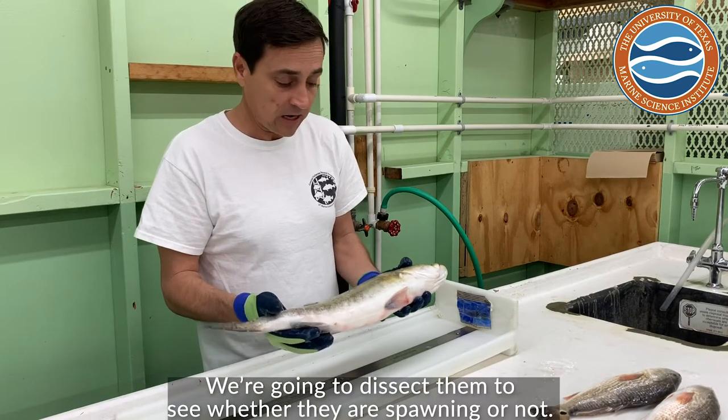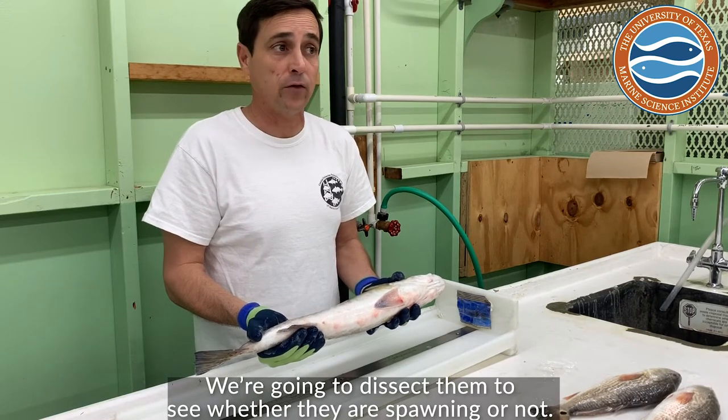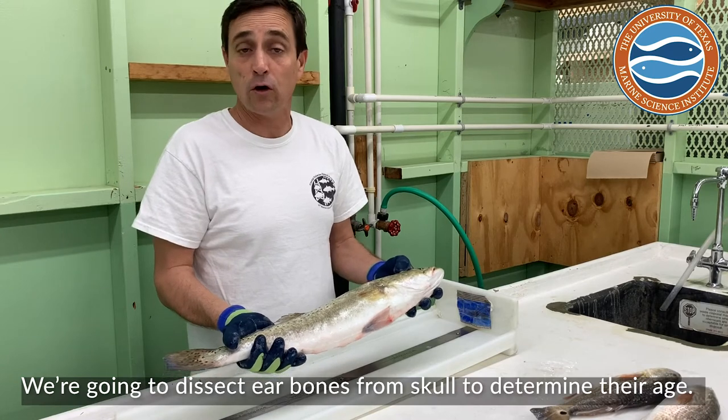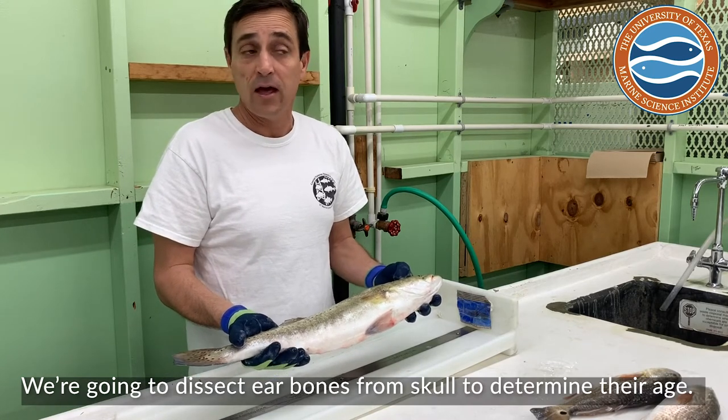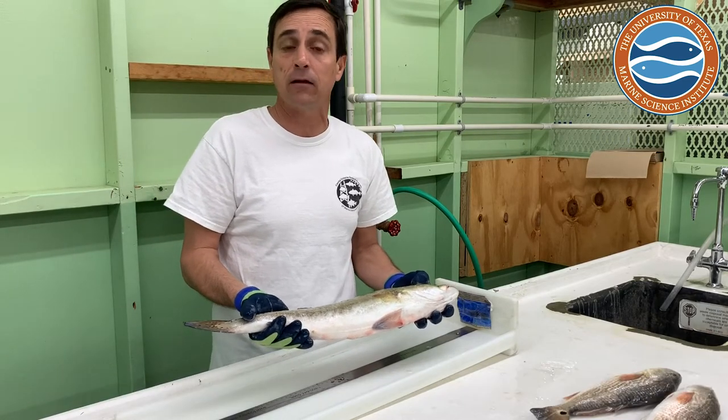We're going to dissect them and take a look at their gonads, which are the reproductive organs, to see whether they're spawning or not. We're going to dissect bones from their skull — we call them ear bones or otoliths — and from those we can actually determine the age of the fish and get better information about how fast they grow.